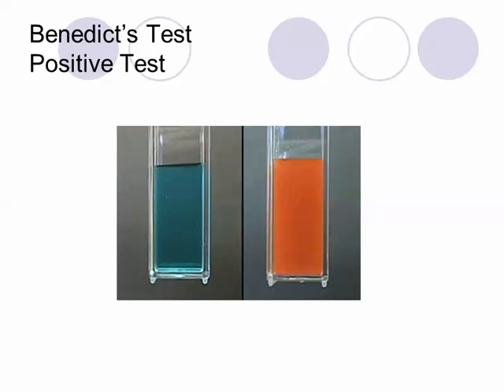You see some particulates that form in the solution itself because you're forming copper(I) oxide, and this is a precipitate that's swimming around in solution. So that's the positive ID for Benedict's. If you get a positive ID for Benedict's, then you know that you're working with a monosaccharide, basically. If you don't get a positive ID, then you're working with some type of disaccharide or polymer. And this is where Benedict's really comes into its power.